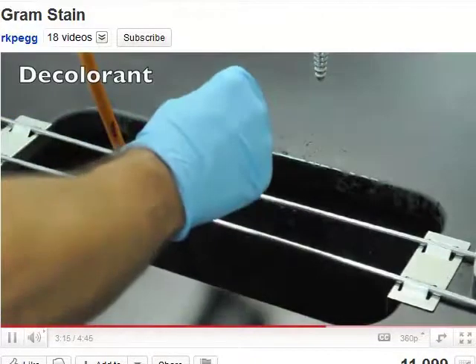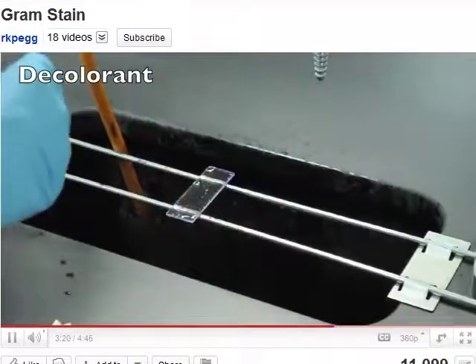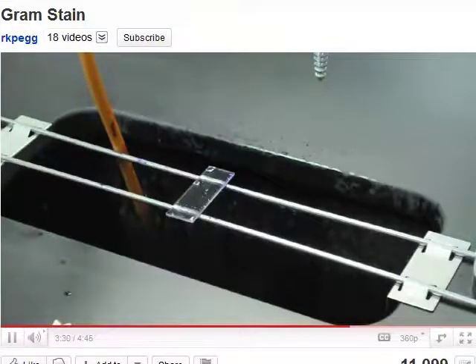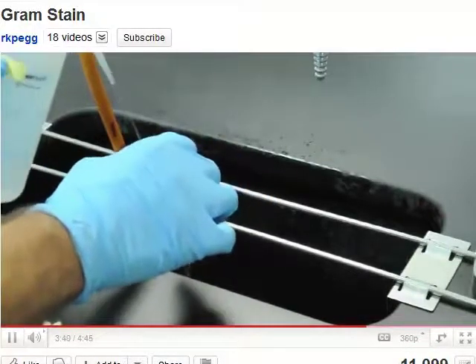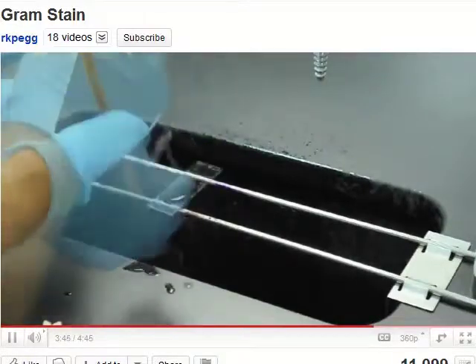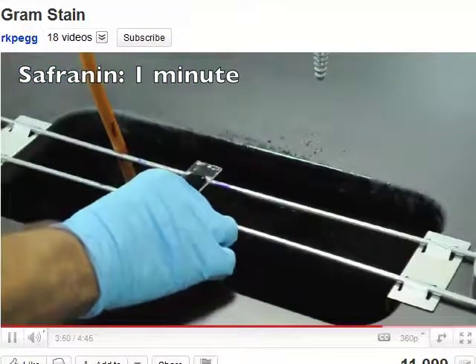Now, we've washed them, and we're decolorizing. We flood the entire slide with decolorant, which is 95% ethanol acetone. And really, you just leave it on for a few seconds. It's not a very long procedure. And then we want to, again, rinse very quickly with water. Now, the acetone alcohol decolorant will remove any unreacted crystal violet. So any crystal violet iodine crystals will remain behind.